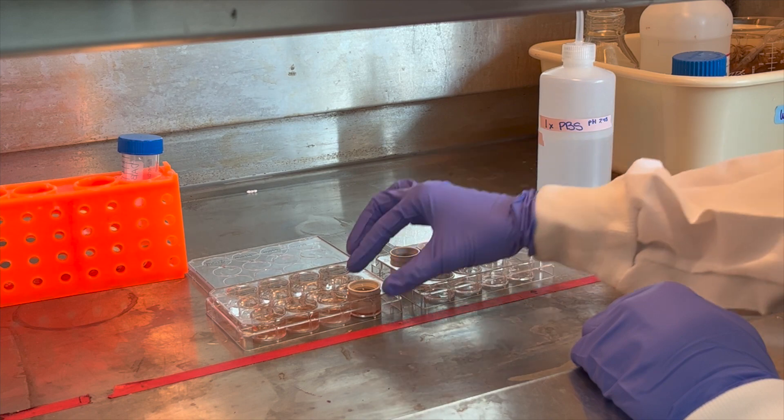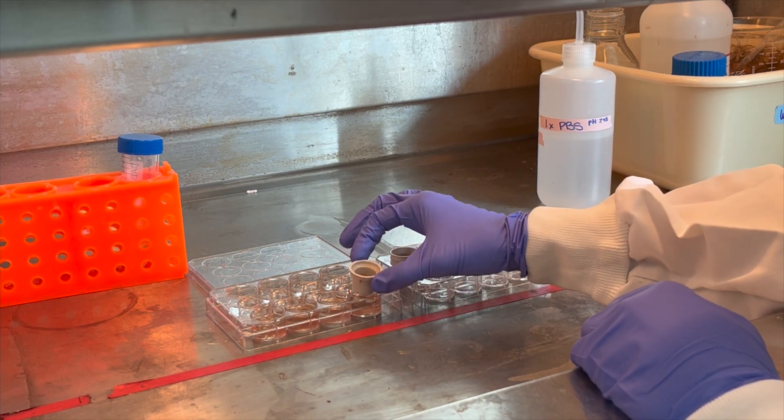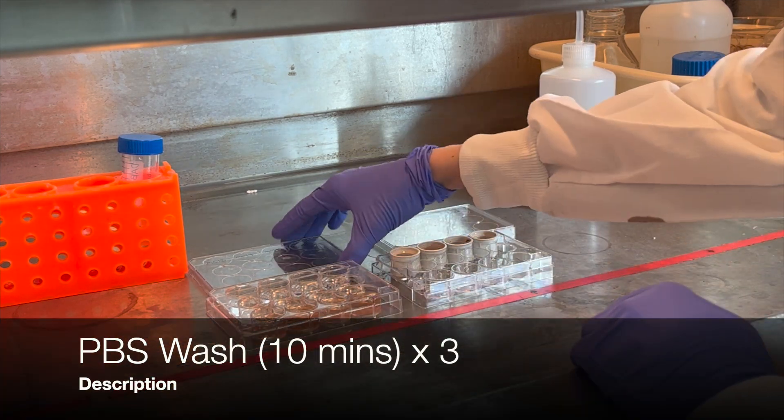To stop the DAB reaction, transfer tissues to PBS and perform 3 final 10-minute PBS washes. Mount the tissues onto slides and allow to dry. Once sufficiently dry, dehydrate the tissues in ascending concentrations of ethyl alcohol for 5 minutes each, starting with 50%, then 70%, and 100%. Finally, move tissue onto Citrusol for 5 minutes and coverslip with Permount immediately afterwards. Once the Permount is dry, the slides are ready to visualize.